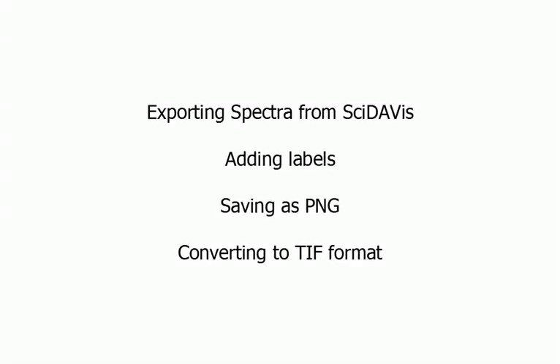In this video I'm going to show you how to take the spectra that you created in SciDAVis, export that into Inkscape, add labels, save it as a high resolution PNG, and then convert it into a TIFF format as if you were submitting it as a figure for a paper in a journal.